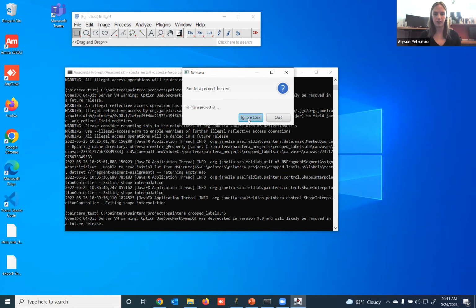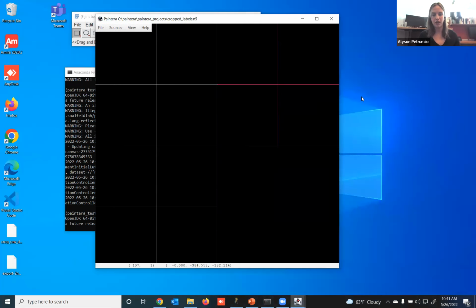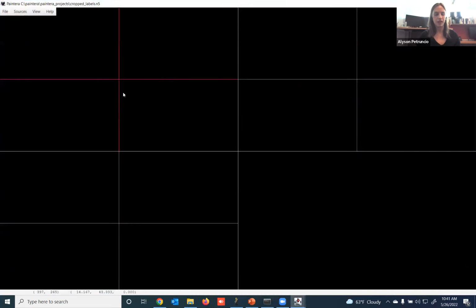I'm going to hit ignore lock. The splash screen comes up. And unfortunately, this is what happens when you don't commit labels, because when you don't commit labels, they're not directly written to the Paintera project itself. So that is no problem.